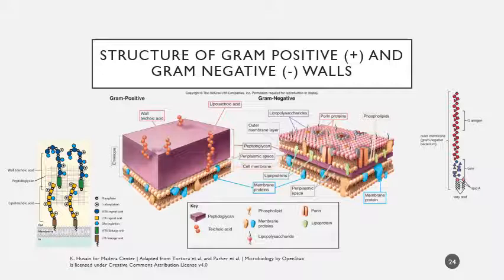But if you're just looking at a cell under a microscope, it's very hard to distinguish that. So going through, adding the different stains and relying on what you know about the chemistry and how those stains interact with gram-positive microbes, interact with the peptidoglycan, interact with the membranes, that's really going to allow you to make determinations about what type of cell you're looking at.